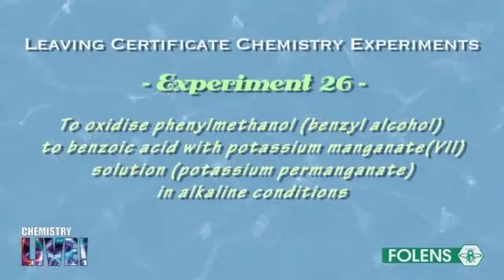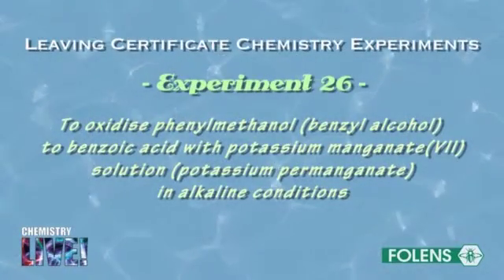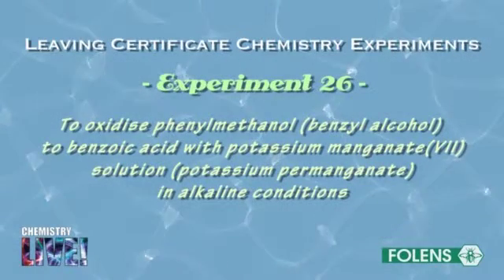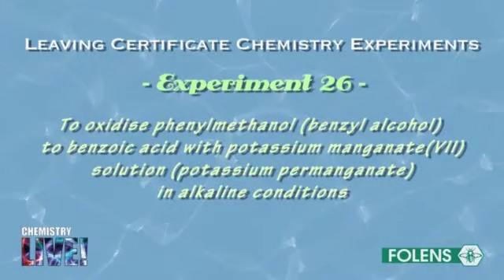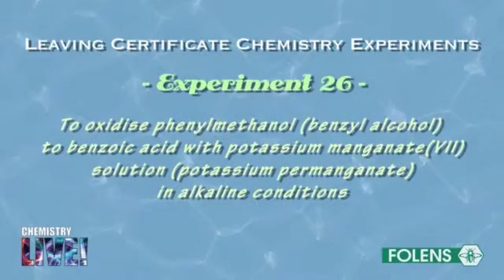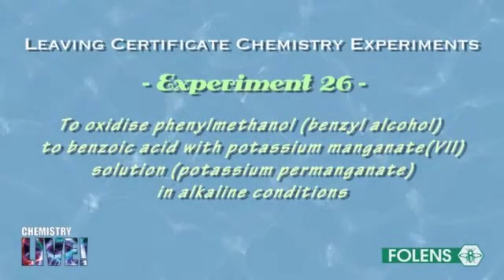Experiment to oxidise phenylmethanol, benzyl alcohol, to benzoic acid with potassium manganate 7 solution, potassium permanganate, in alkaline conditions.